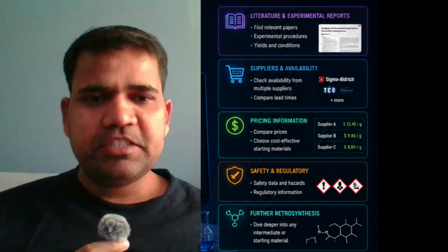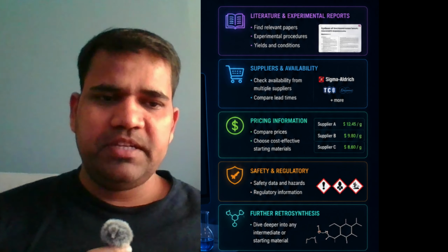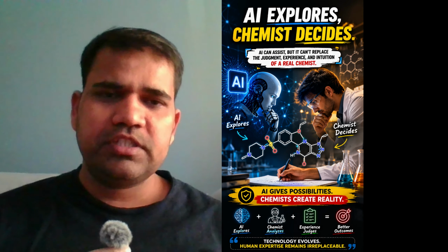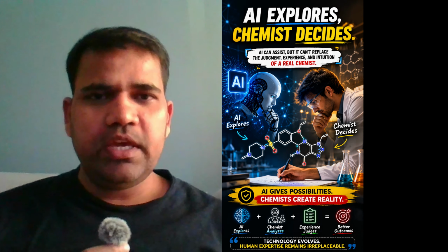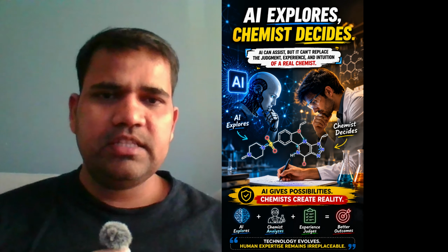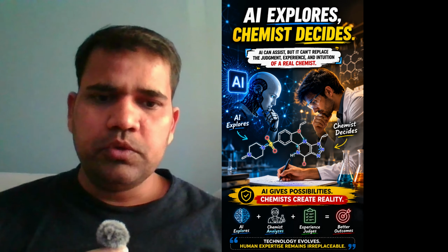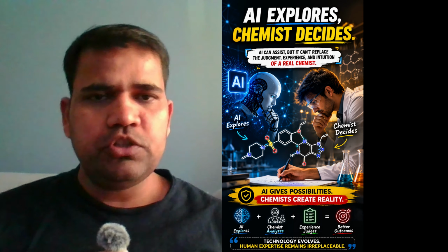But remember, the suggested routes still need a chemist's judgment. We need to consider feasibility, selectivity, reaction conditions, cost, safety, and scalability. So AI is not replacing the synthetic chemist. It is helping us to explore the possibilities much faster. The AI can suggest the routes, but the chemist still decides which routes make sense.